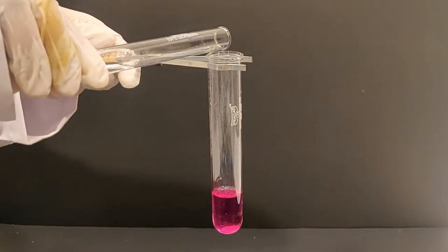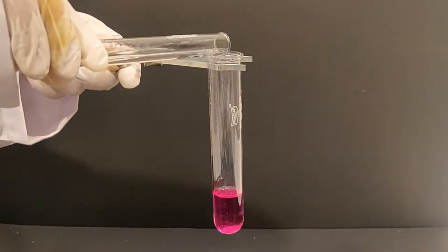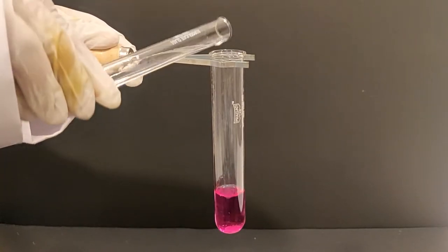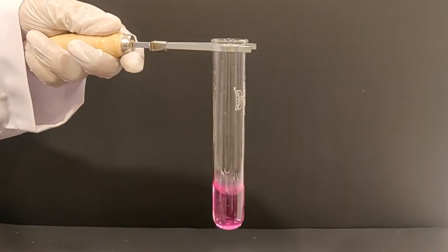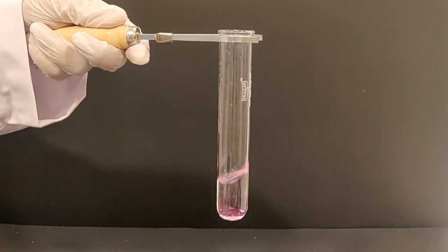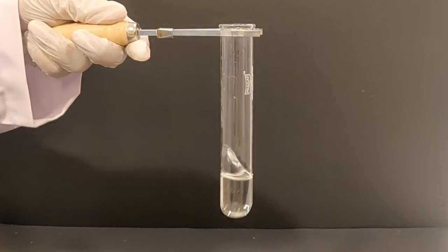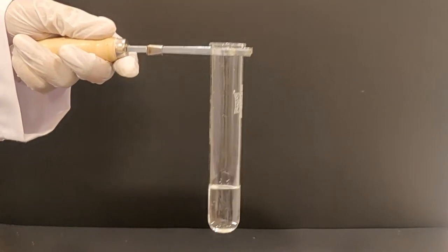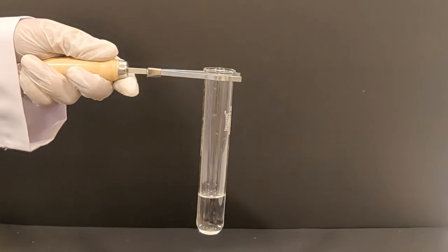Now, add some dilute hydrochloric acid to the test tube. You will notice the pink color vanishes and the liquid becomes colorless again. Why does this happen?